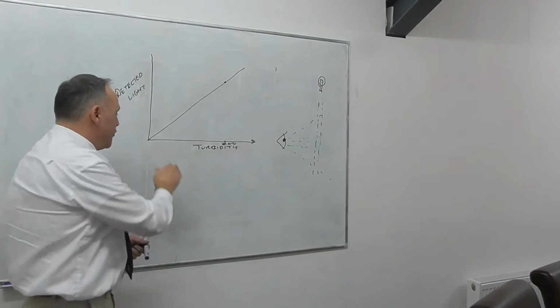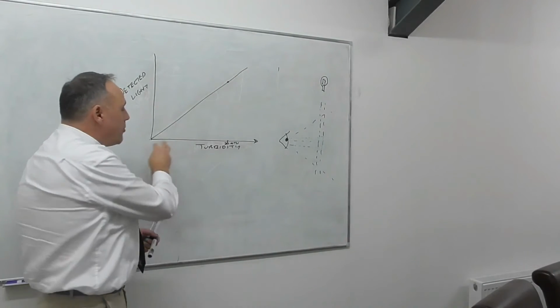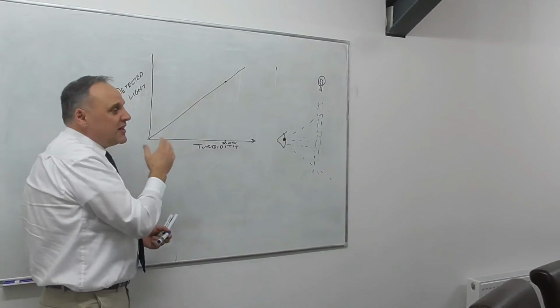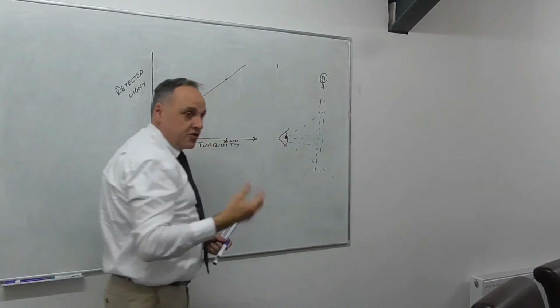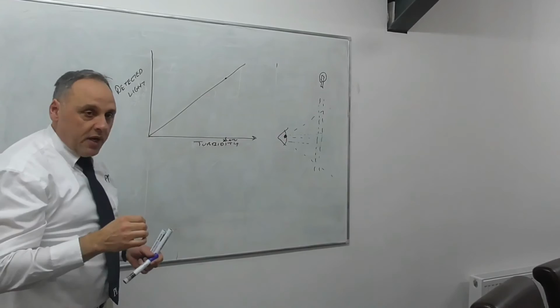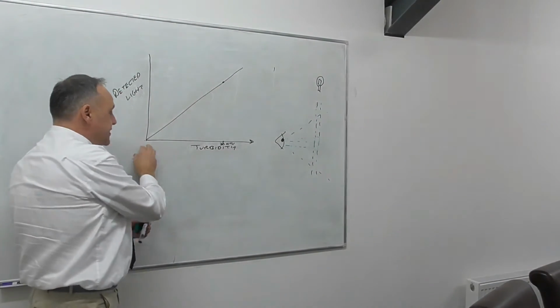They either fix the 0 when they manufacture that sensor. Problem with that is it does drift over time. So your 0 over time will change and not be correct, particularly with regards to background light, to stray light. The other way of doing it is to ask you, the customer, to put a 0 NTU sample in the sensor.